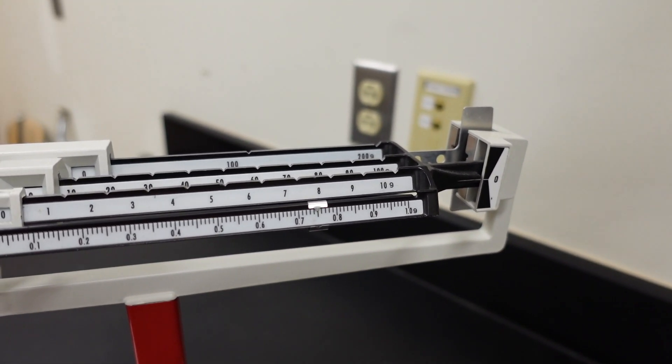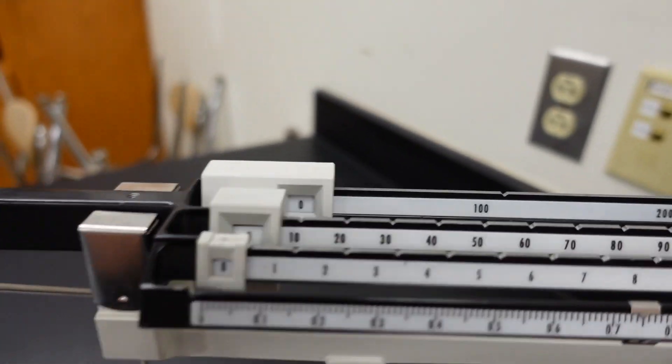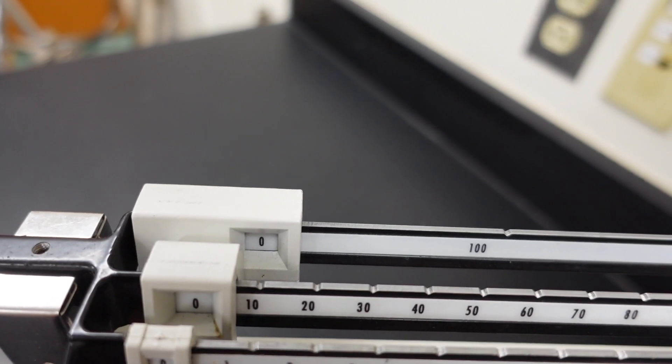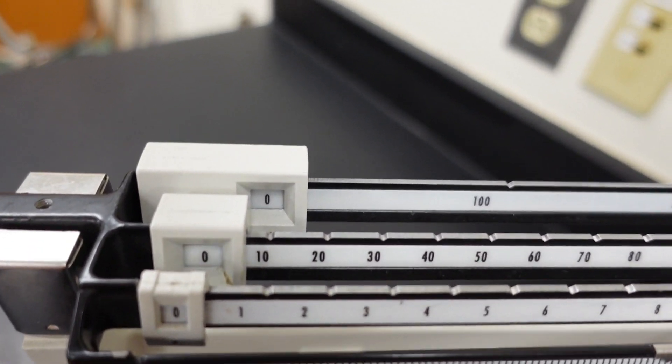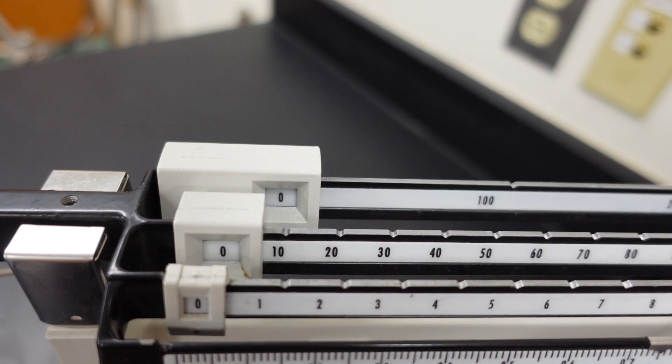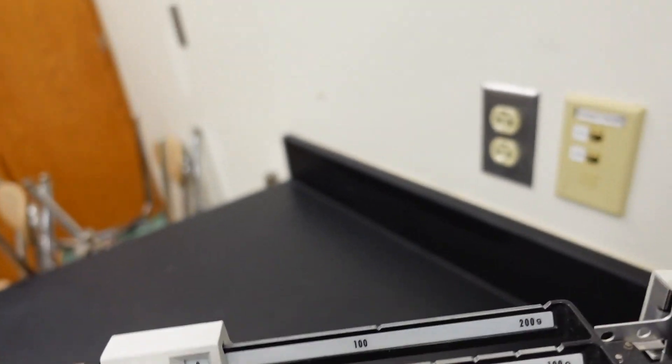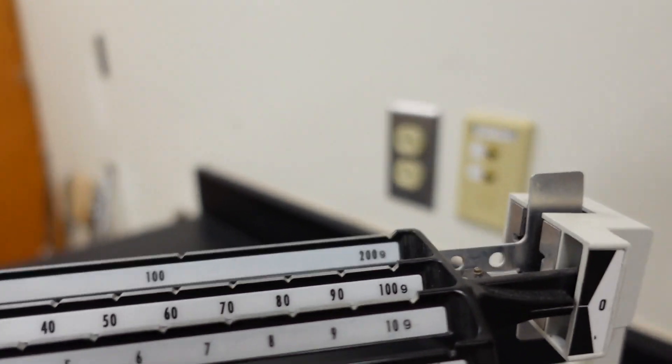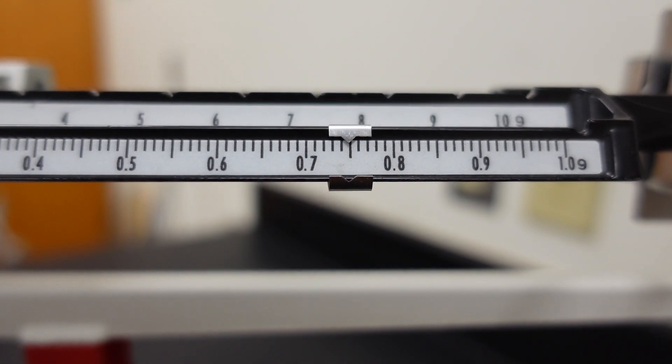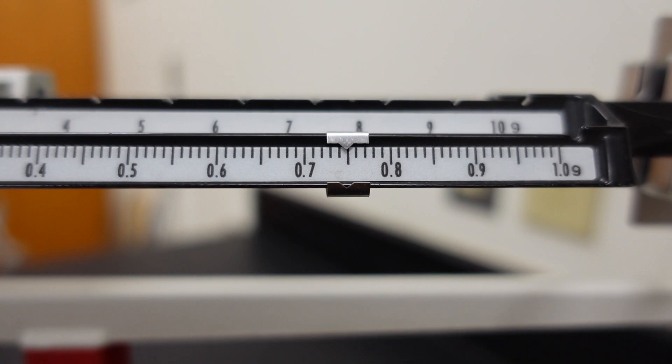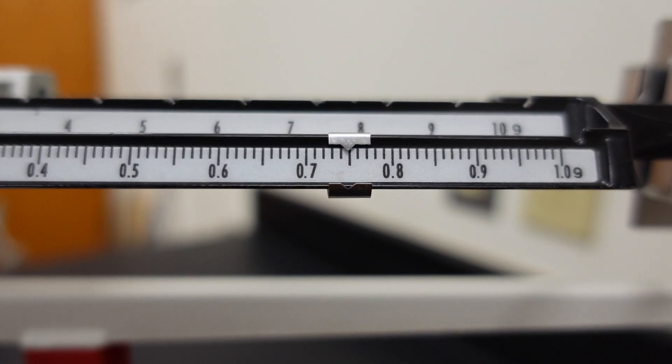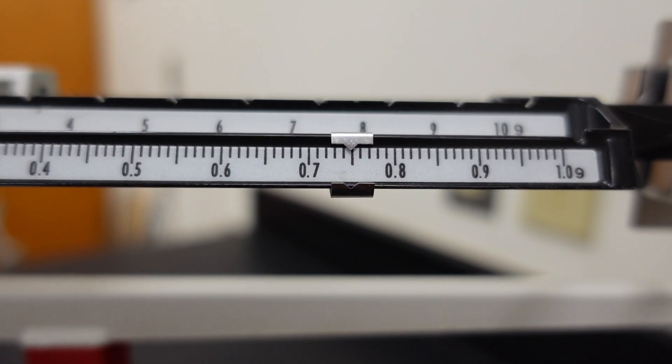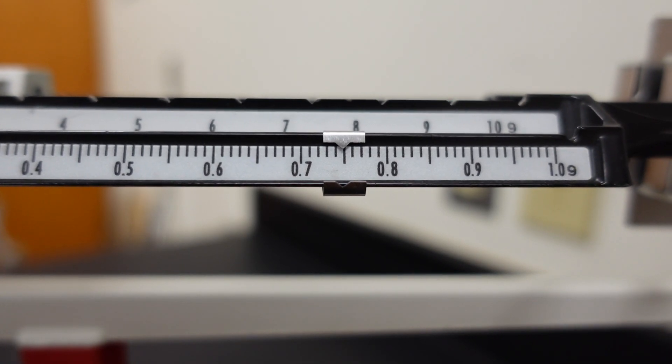And then let's read this measuring device and see what it says. So here we go with the hundreds, the tens, and the ones. Now let's get that last mass rider. Let's get it set. And that's the mass of the aluminum foil.